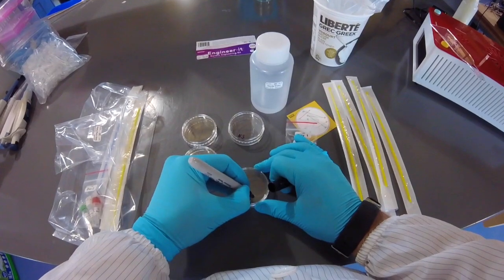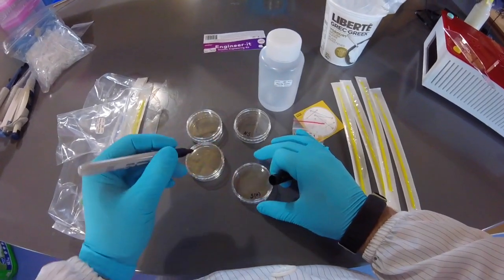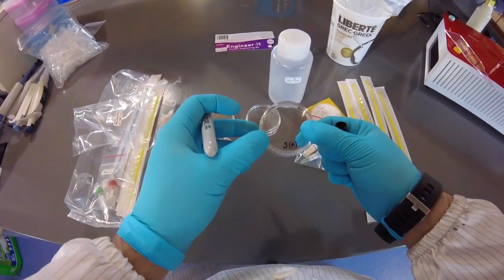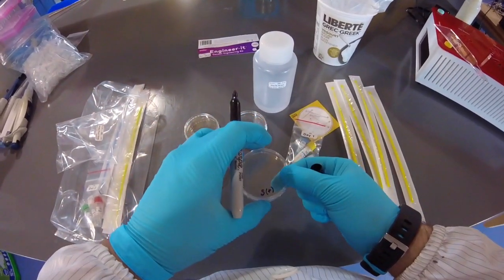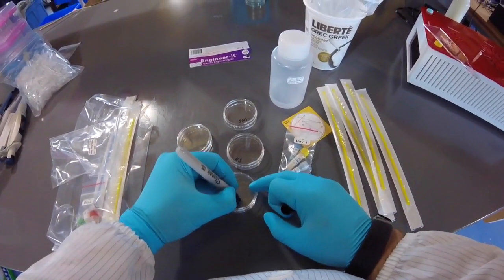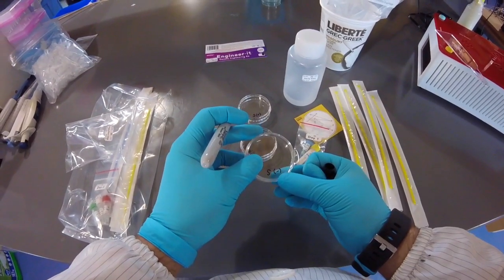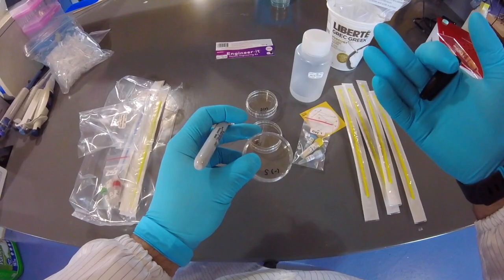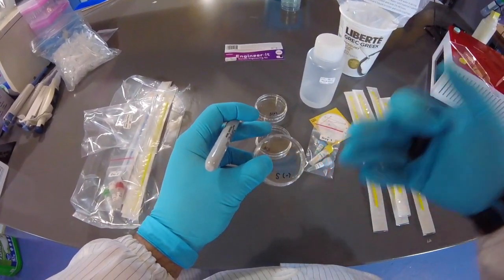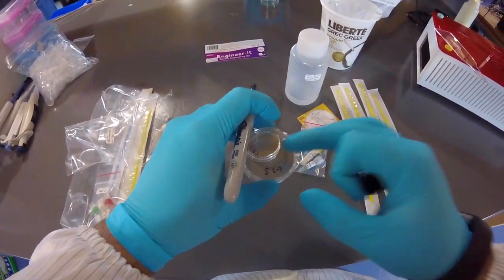Another plate, I'm going to put an S for selective, and I'm going to put a plus next to it. Now, selective again means you've added antibiotics so that you can select for your engineered cells. The plus stands for the positive control, which I mentioned is in the day 2 bag, and we'll talk more about that tomorrow. I'm going to write another S with a minus. Okay, so S minus, this is the negative control. All right, and a negative control essentially is when you do an experiment and you usually remove something from that experiment, and if that experiment runs well, you'll get a negative result. So for example, like nothing will happen, right? And I'll talk a little bit more about that. We're going to do this one today.